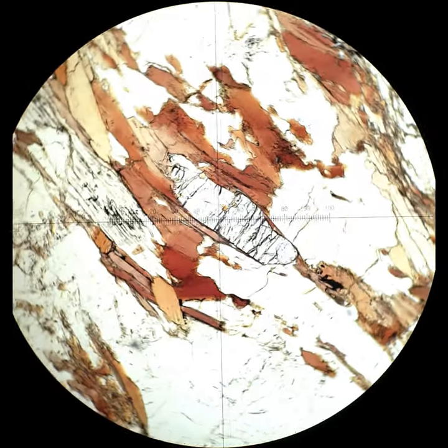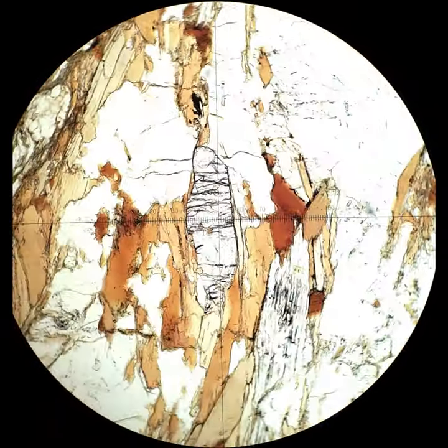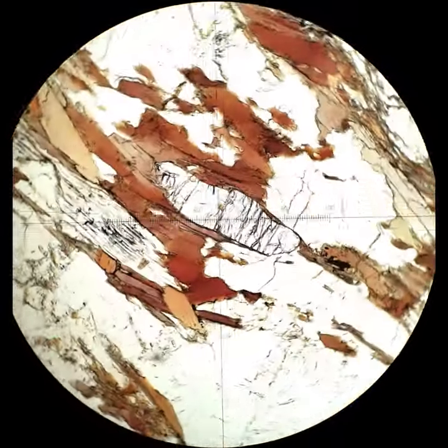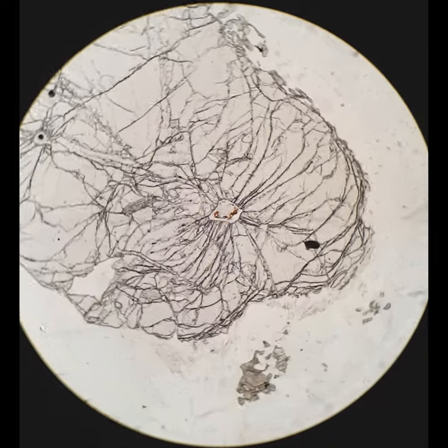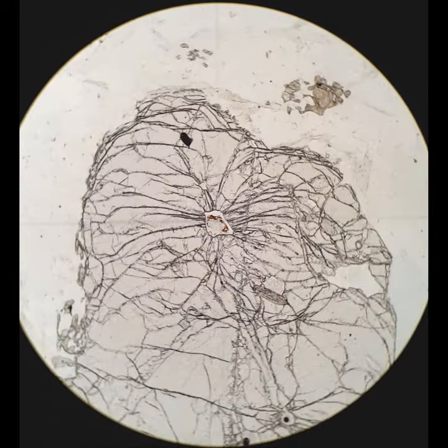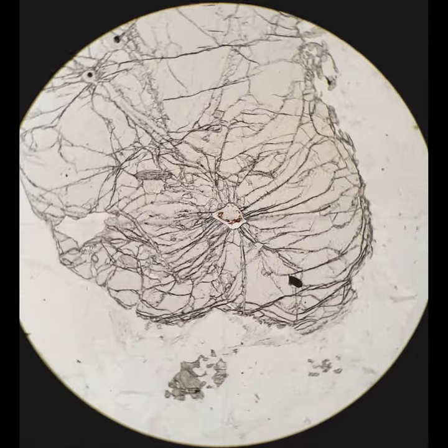Some minerals don't have cleavage. This is an apatite crystal, and you can see some fractures that are perpendicular to the long axis of the grain, but they're not regularly oriented, so they can't be cleavages. And here is a garnet that has been blown apart when coesite inverted to quartz. You can see those fractures don't have any preferred orientation — they radiate outward from the center. You can tell from this that garnet doesn't have cleavage.